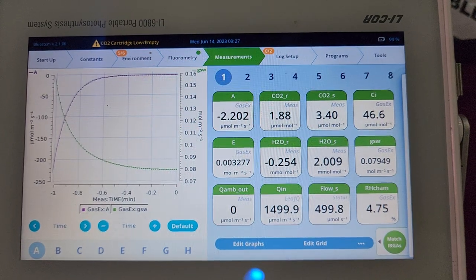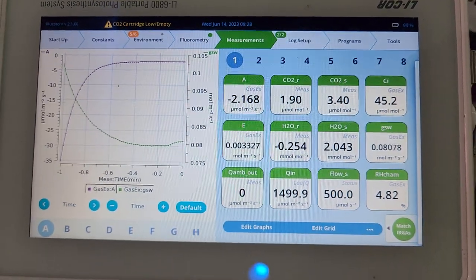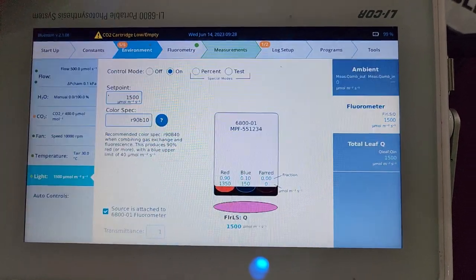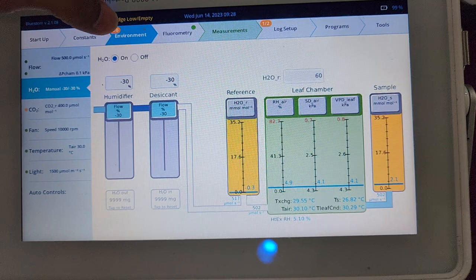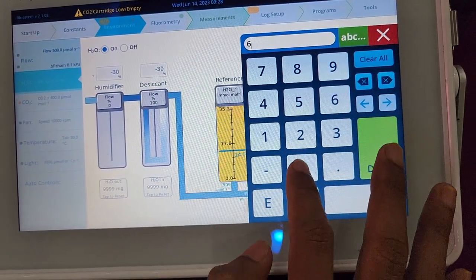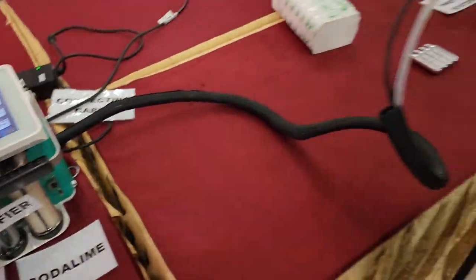So when this happens, does it mean the photosynthesis is not happening? What does it mean? You know what? Maybe you might want to know about this. Maybe this is going to be useful for you later when you do use this machine. Leaf selection is very important when you do photosynthesis. You shouldn't be using older leaf like what we are using now. This is old leaf. It's a lot lower, right? So to get a good photosynthesis reading, choose the top 3 to 5 leaf from the top, fully expanded, meaning that the leaf has stopped expansion. Okay, so maybe we can change it to here.